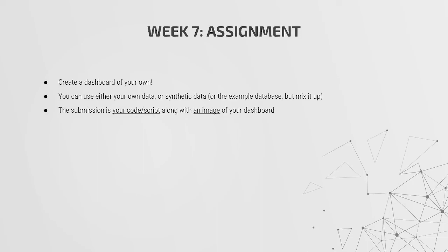The submission for this is we want to see the code that you use along with an image of your dashboard as well. You don't have to submit the database that you use to create this, so that if you use your own data, you don't have to send that to us, so that other people don't see your data before you're ready to publish it. And also, just some extra points if you can include your lab's logo on your dashboard as well. So I really look forward to seeing what you come up with.